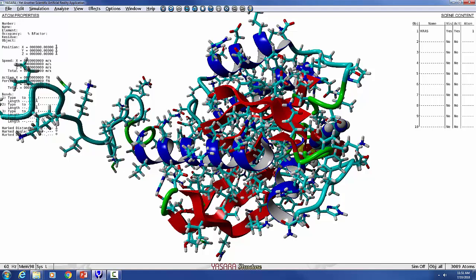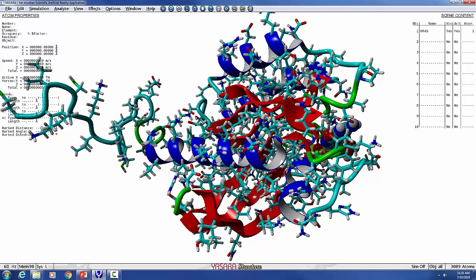Actually, I got this PDB file from a database that one of our colleagues has, so you can request this and see if we can find the same PDB file for any other protein. We have a limited number of proteins that have been analyzed this way, but we could check, so that might save some work if you need it.